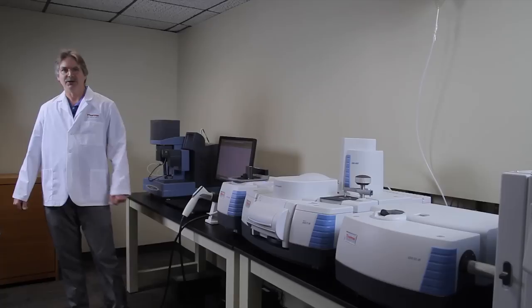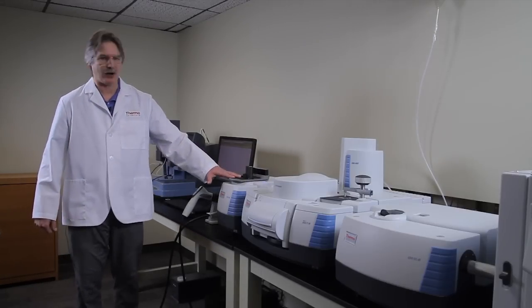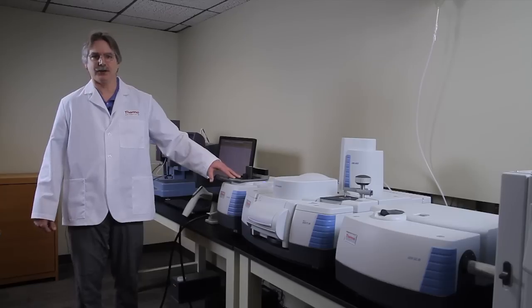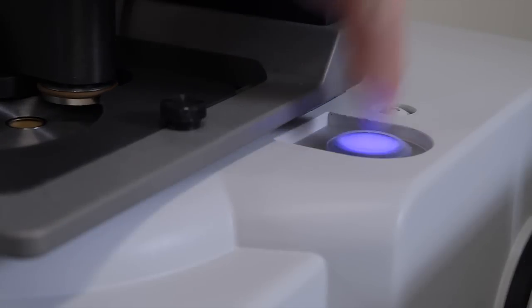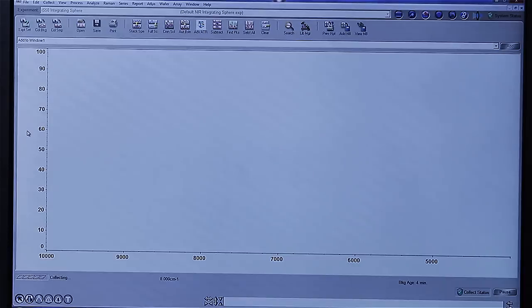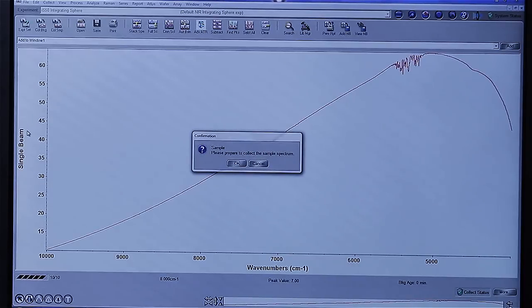Right now, the instrument is ready for the analysis. And what I'd like to do then is show how we can collect polymer spectra using the integrating sphere. Once again, all we need to do is push the button. A background spectrum is collected.